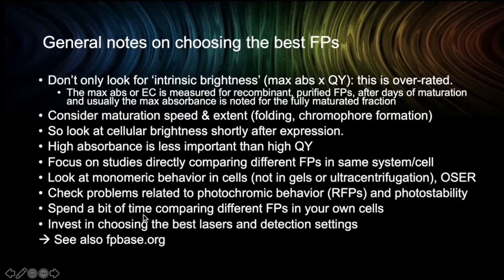I can always recommend to spend a bit of time to compare different fluorescent proteins in your own cells in your own lab before starting elaborate transformations of mice or plants. So first do the simple experiment and see whether your probe or sensors are behaving normally in simple systems before going for the more difficult experiments.